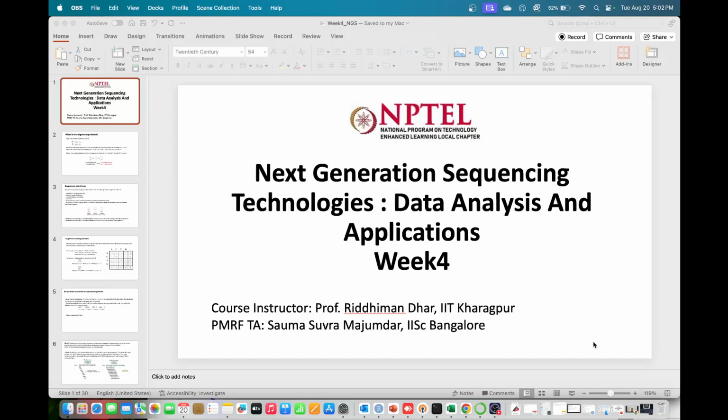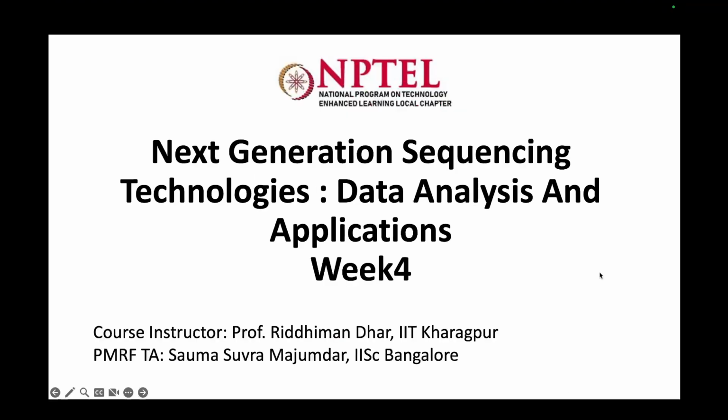So, today primarily we'll discuss alignment, different algorithms for alignment, different data structures used for alignment, and how we tackle certain issues that come up during genome alignment. We'll focus more on the different types of algorithms and how these different types of data structures are made for such big data sets.